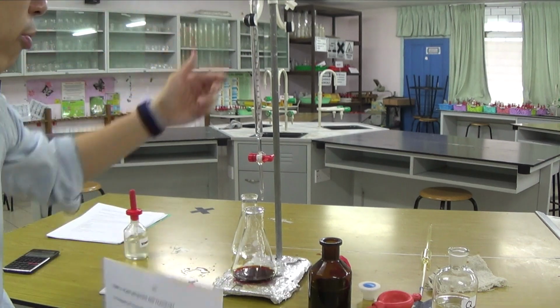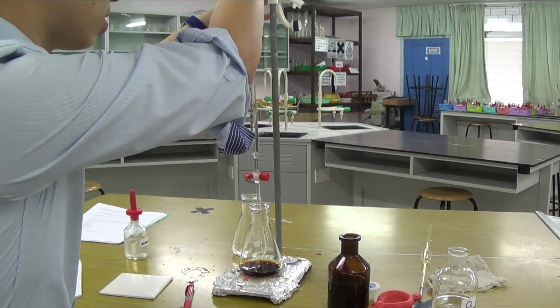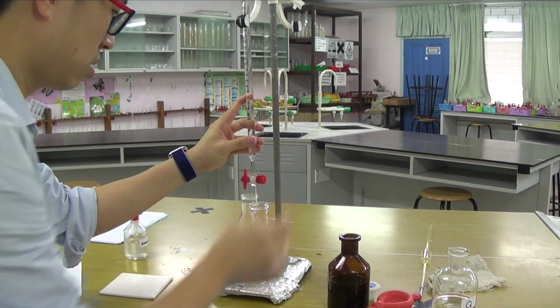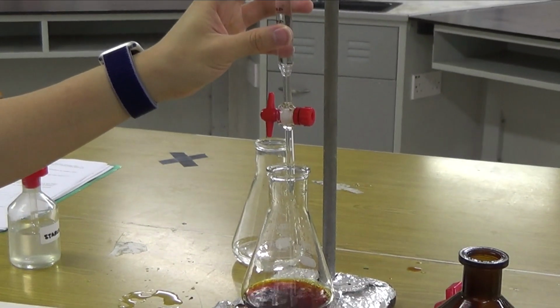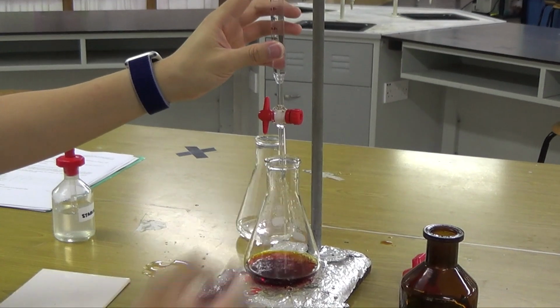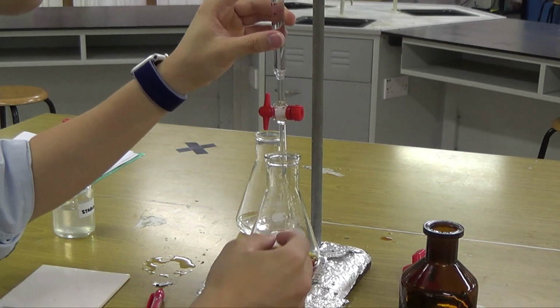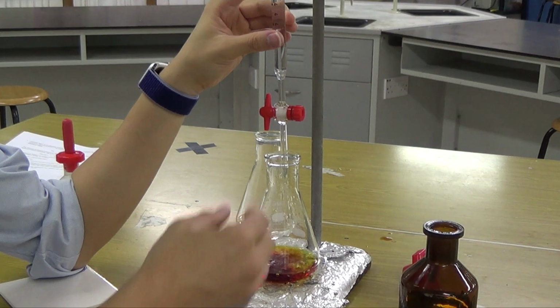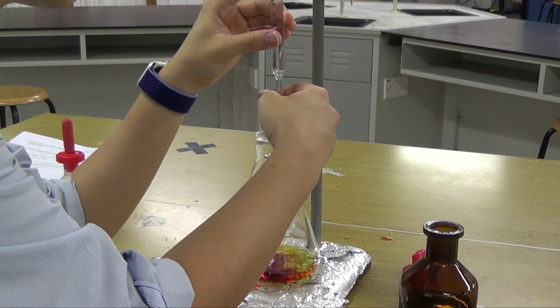So I need to be careful when I reach 41 and do it drop by drop from there, just to be safe. And don't forget to add your starch indicator at the end. So where is 41? Yeah, 41 is here. We're just going to zoom in a little bit. So I don't need to rough it or anything because I've done my exact titre. I roughly know where they are now. So 41 is where I will stop because that is just before the exact endpoint. So getting close, getting very, very close.